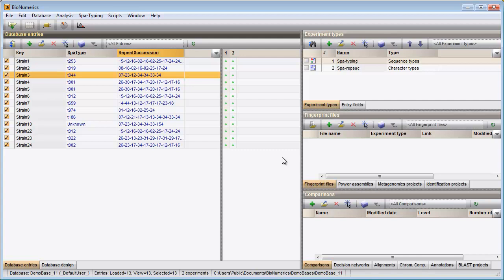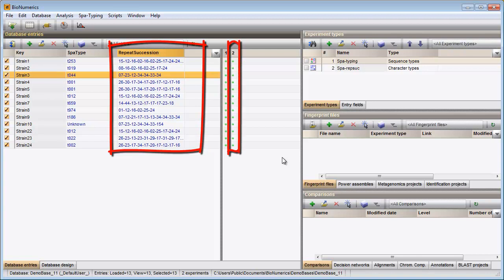The matched repeats are stored in this field and in the Character type experiment.